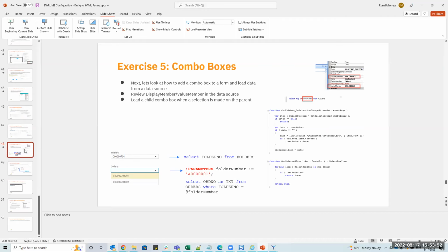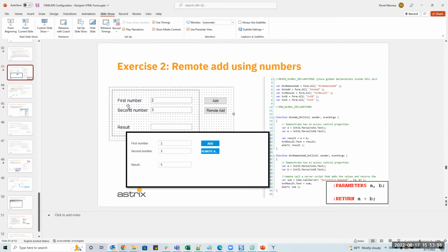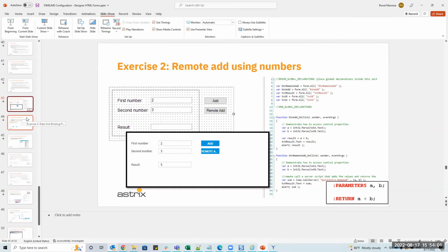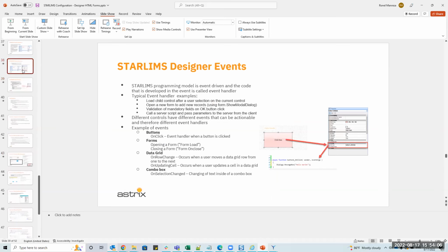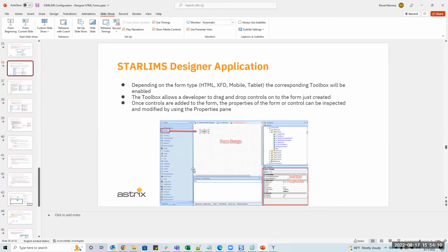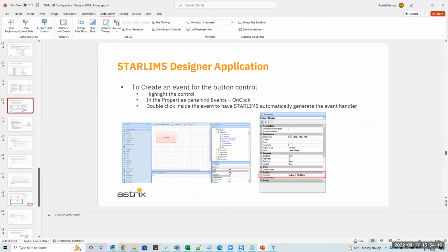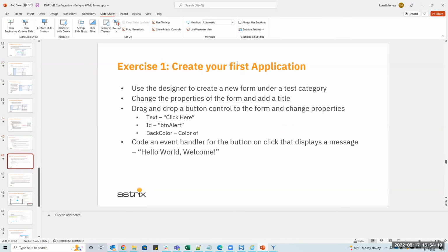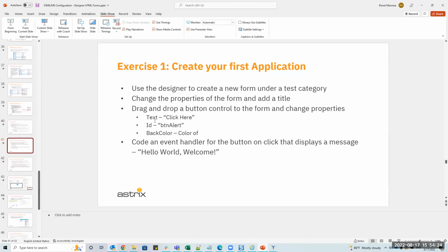On Friday, we're actually leaving the presentation layer and moving into the server layer, which is kind of crazy. But like I mentioned at the beginning, you can self-train on a lot of these things. I think this was mostly on relative layouts and controls and real basic introductions. But let's do an example to put everything together. We have half an hour, so we should be able to do these two.